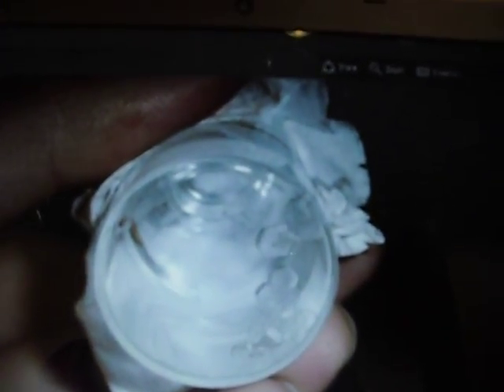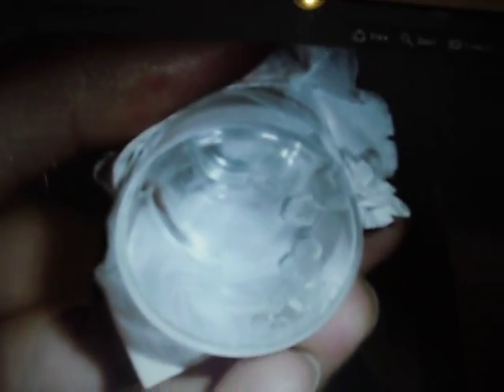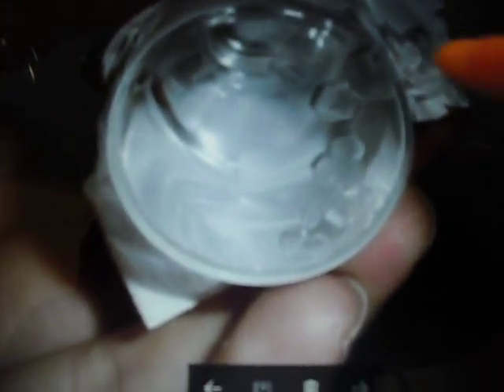So here's the photo of the alum crystals. There are about 9 crystals formed, with some of the diameters being as small as 1 millimeter and as large as 4 millimeters. And so you see these ones are bigger and some of them are smaller. And also when the crystals are growing, the crystals tend to form on already existing crystals due to intermolecular forces. So instead of forming small new crystals, the existing crystals get larger.